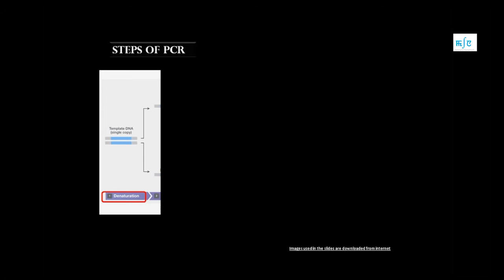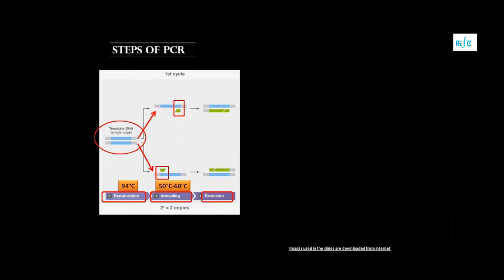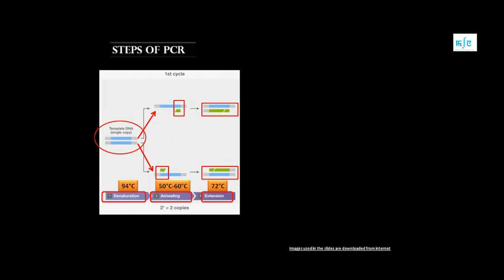So the next step is to run the PCR. Inside the PCR tube there are three important steps occurring. So the first step of PCR is the denaturation step where the double-stranded DNA is separated into two single-stranded DNA at a temperature of 94 degrees Celsius. The second step is known as the annealing step which occurs at 50 to 60 degrees Celsius, where the primer will bind to its specific complementary region in the target DNA. The third step is known as the extension step where the primer with the help of polymerase enzyme will synthesize a new strand of DNA from the original DNA or the older DNA template.